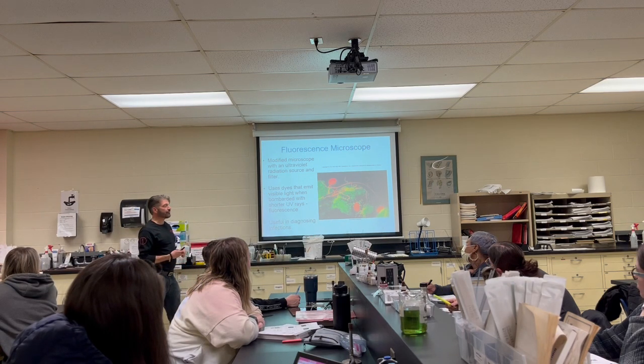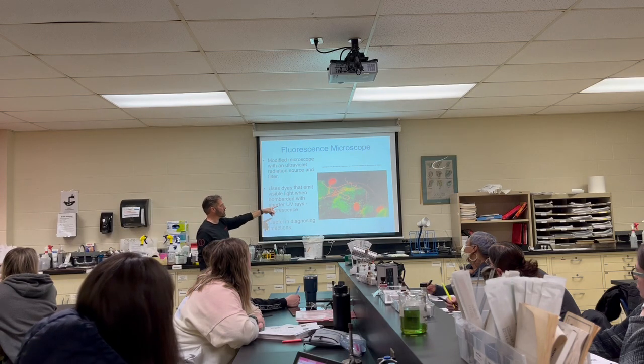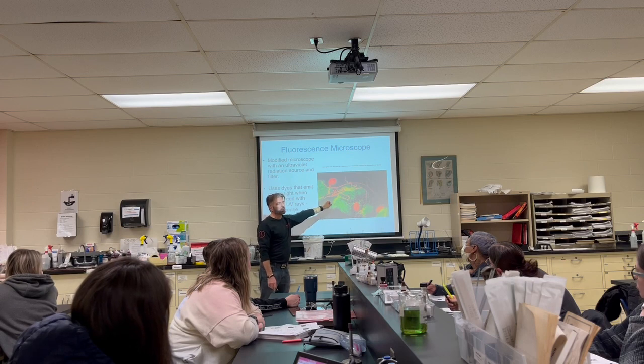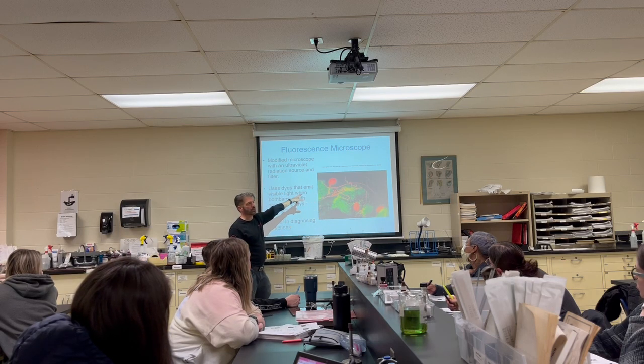This is useful in diagnosing infections, we can tell for sure. That's a strep. That's definitely strep. And that's probably, I would say, E. coli, just by the shape of it.